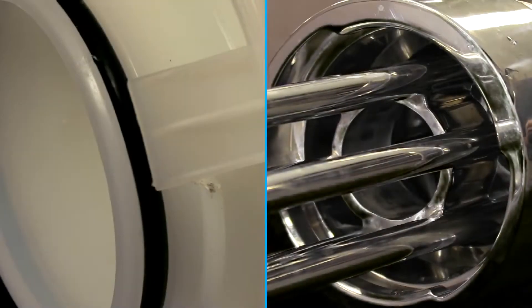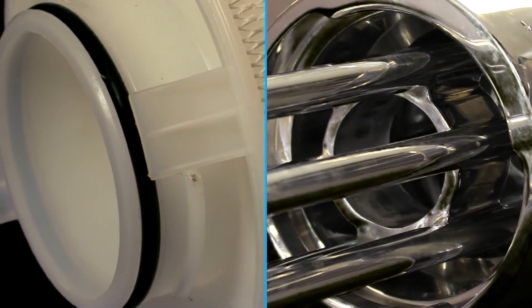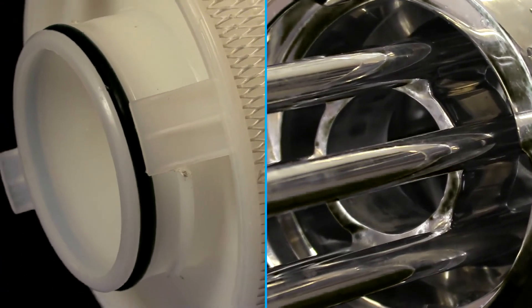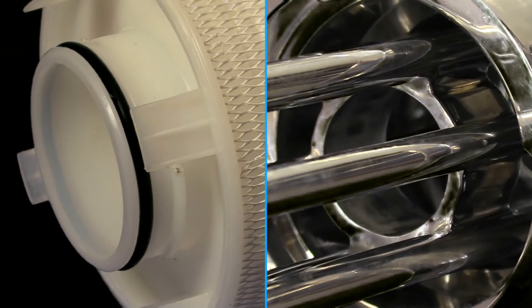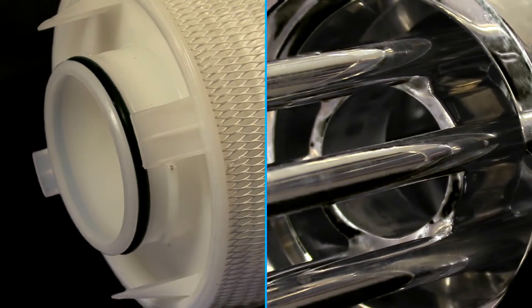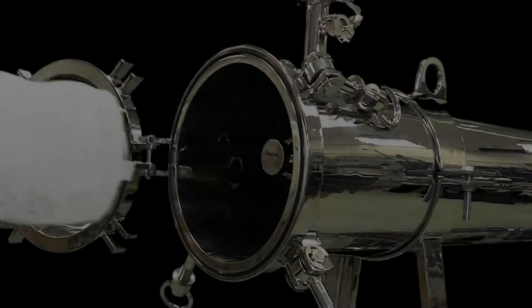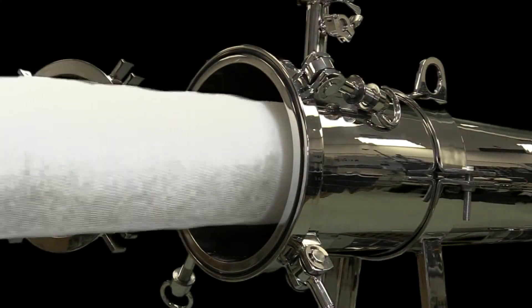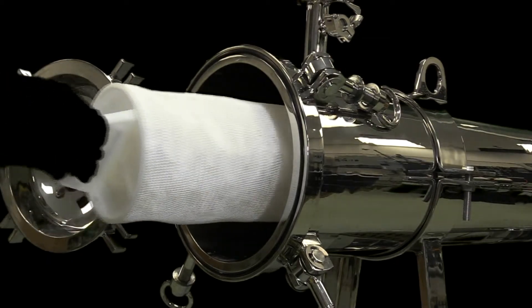The notched end of a high-flow filter fits into the housing base via a twist-to-lock seating mechanism that provides a positive leak-proof seal. Wet the high-flow filter o-ring.